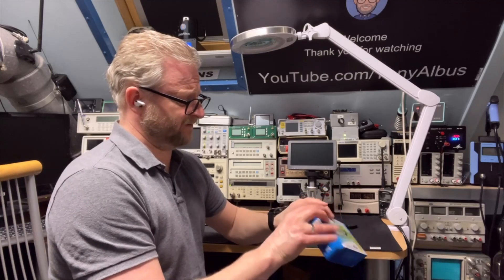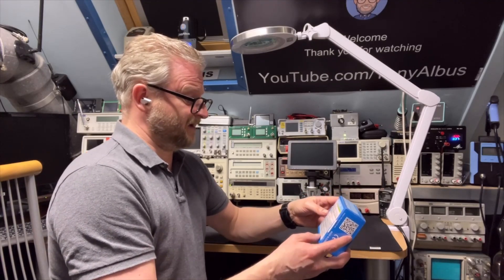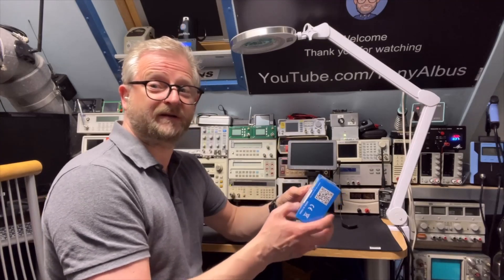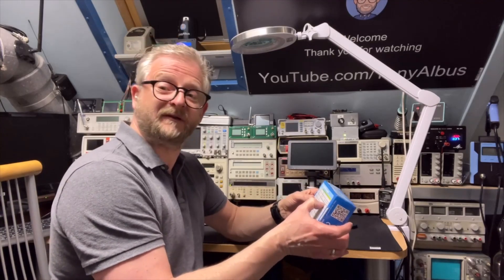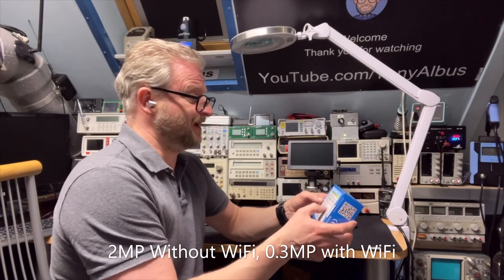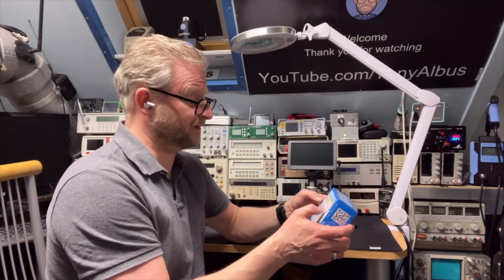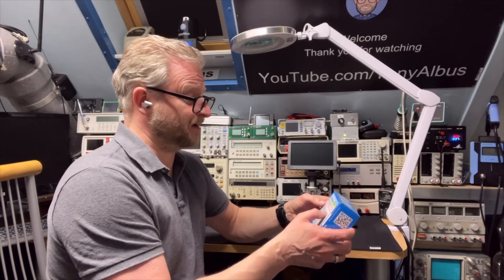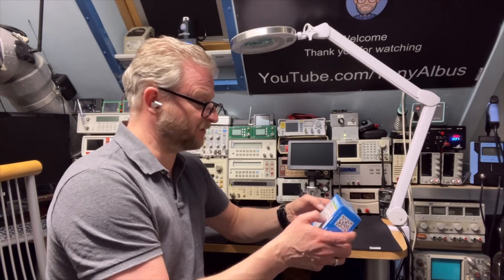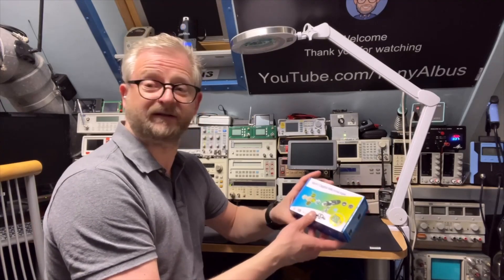It even has an internal battery, if I must believe the specs. The Wi-Fi model usually comes in two megapixel, but this Wi-Fi model I did not find with that — this one is 0.3 megapixel, so it is very low. But before I make my conclusion on that, I'd like to try it and see what we have here.